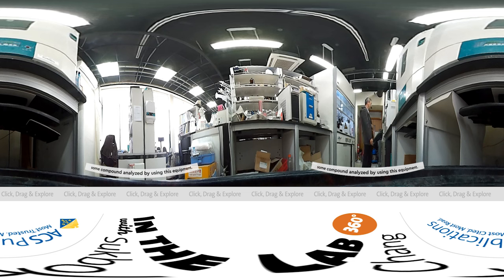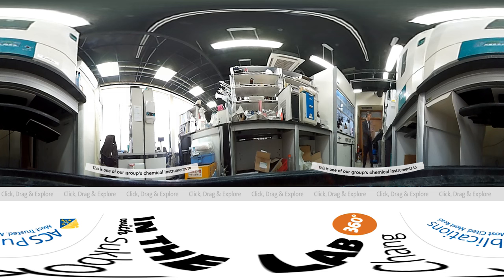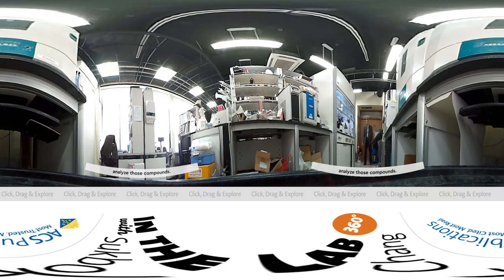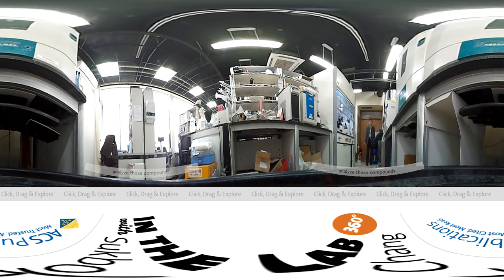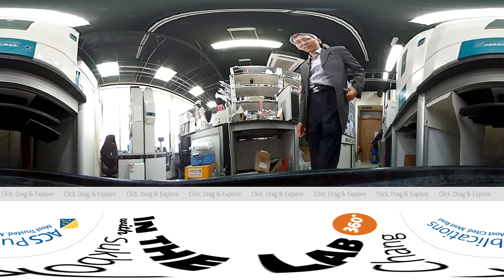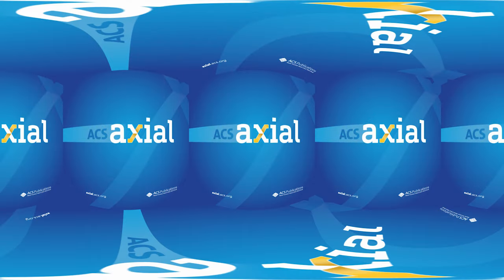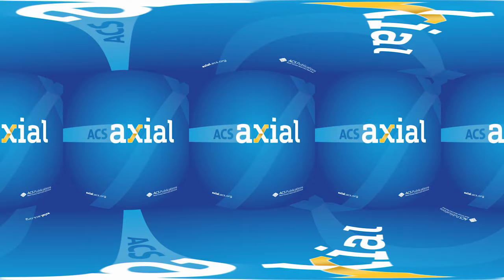This is one of our chemical instruments to analyze those compounds.